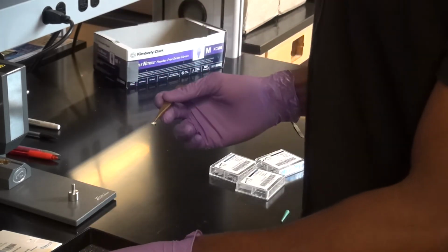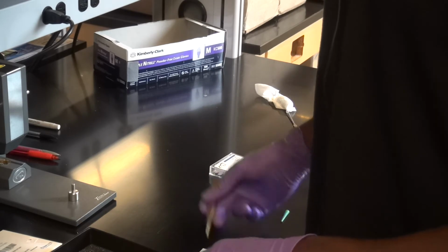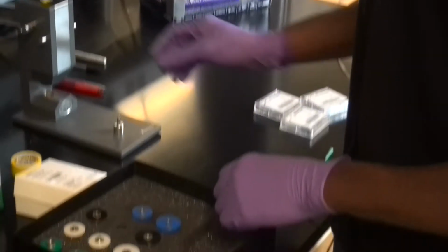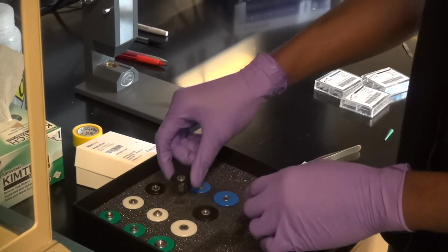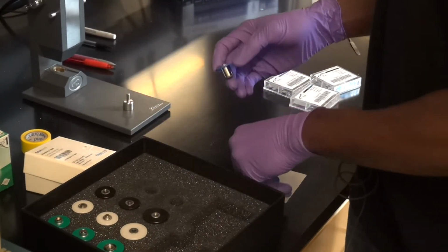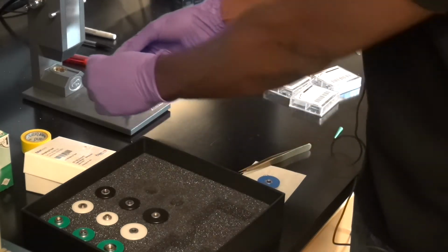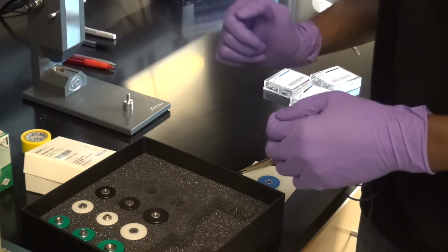What you would like to use now is the blue color. So I'll show you how to prepare these types of pans. We're going to simply replace all the black colors with the blue colors. There are only two. This is the bottom piece, and this piece, just like the other one, has a magnetic base, and it goes straight into the top of the press.